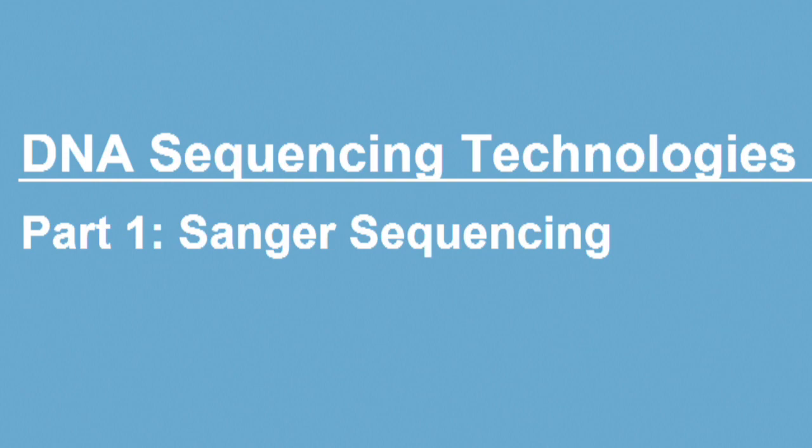So we've gone over the basics of how Sanger sequencing is actually done. This is still used to validate sites, even though there are more modern techniques. Sanger sequencing still is employed. It has the lowest error rate of the various sequencing technologies. So this is why it's still of utility to research.